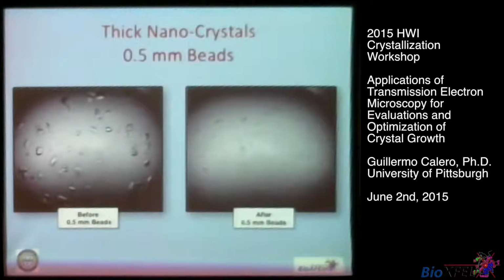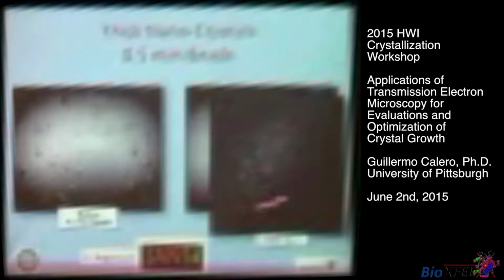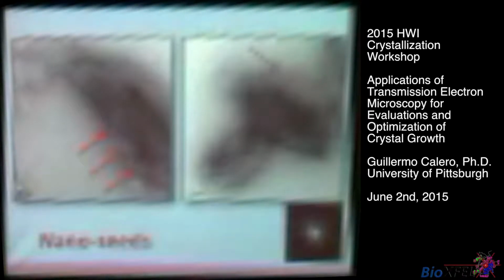Well, before that, I'm going to show you how it looks. This is before we break them. And basically, after we break them, you see a lot of debris here, right? But if we do the UV, using the 40x objective, you can clearly see how homogeneous and nice the sizes of these nanocrystals are. So we were very excited. We took these to the EM, and then look at this. That's what we saw. These were basically the first really nice nanocrystals that we were able to see.